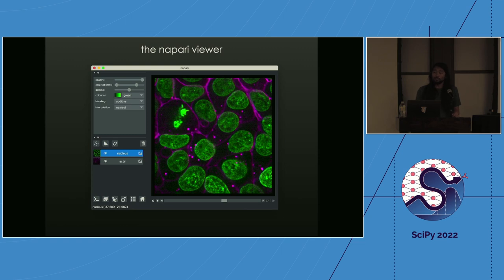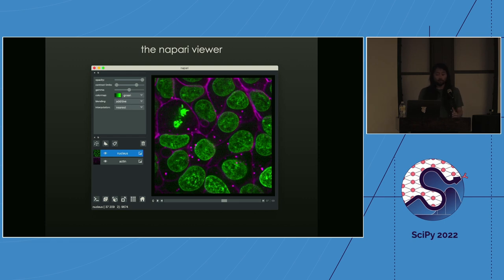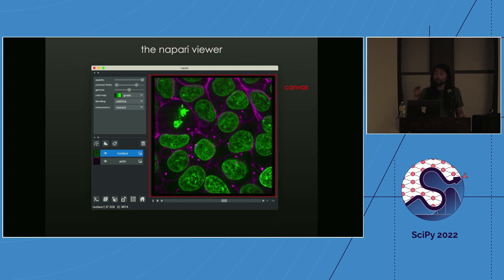Now a bit of an introduction into the viewer itself. The viewer is one of the main top-level concepts — the graphical user interface window where you actually view and interact with images. There are a few different components. First is the canvas, where all the visuals are rendered: your images, and any annotations like points or shapes.